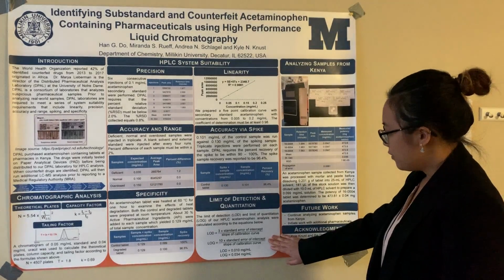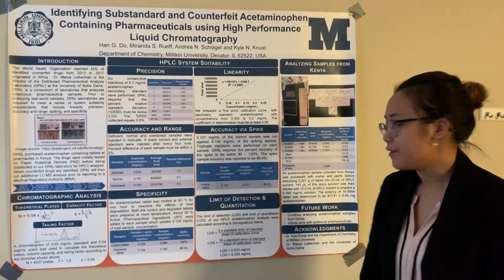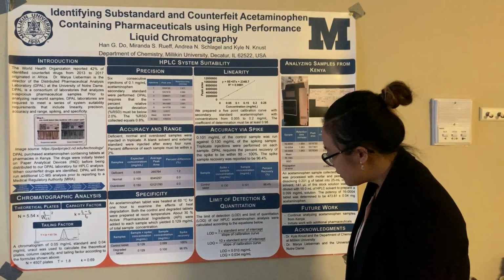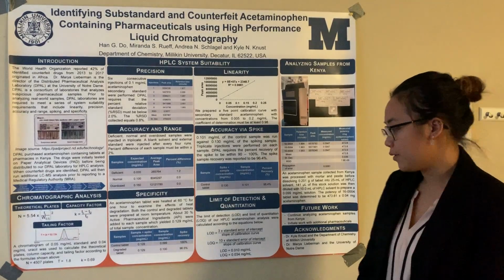These two are the equations that I used to calculate the limit of detection and quantitation. For LOD, I got 0.01 mg/ml and 0.034 mg/ml for LOQ.